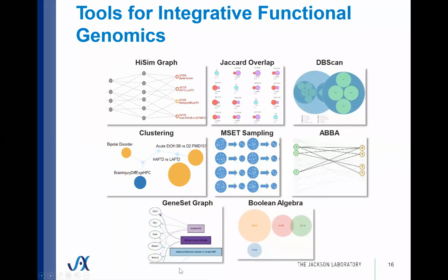Sorry. I think I was elaborating on different tools and how pretty some of these graphics are. We have Boolean tools to combine, collapse, and compare gene sets. So if you have a very large query, you entered your favorite word and you retrieve 500 gene sets, and you want just the highly connected genes that are present on a large proportion of those 500 gene sets, you can use the Boolean tool to compress them all into a single gene set.